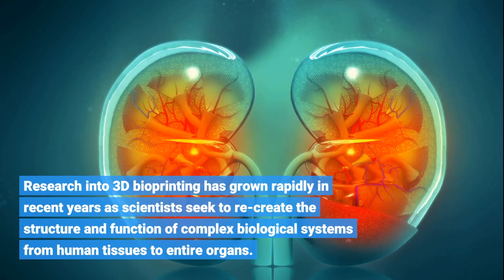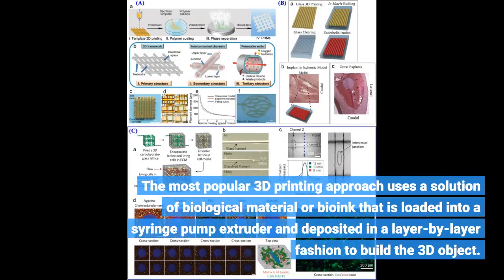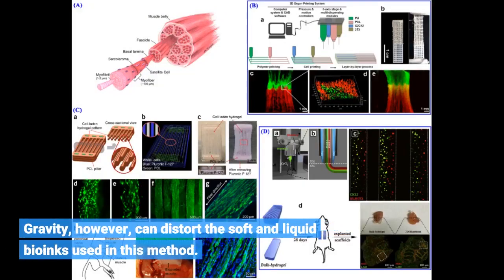Research into 3D bioprinting has grown rapidly in recent years as scientists seek to recreate the structure and function of complex biological systems from human tissues to entire organs. The most popular 3D printing approach uses a solution of biological material, or bioink, that is loaded into a syringe pump extruder and deposited in a layer-by-layer fashion to build the 3D object. Gravity, however, can distort the soft and liquid bioinks used in this method.